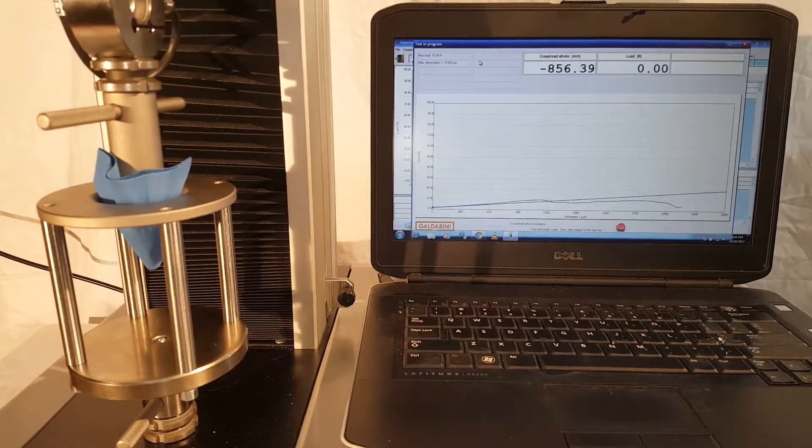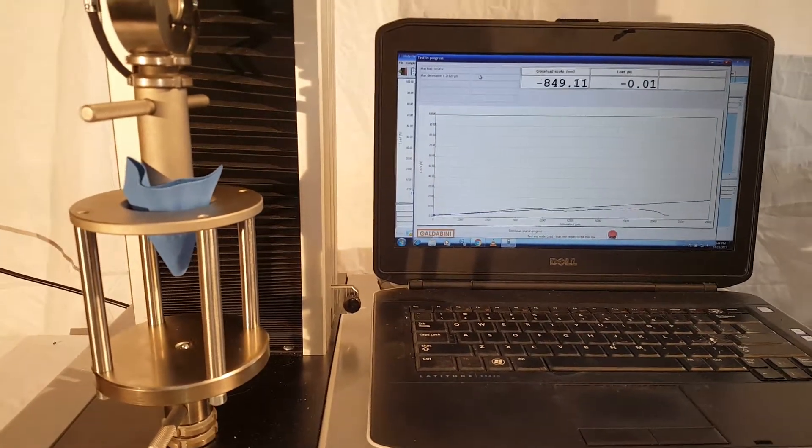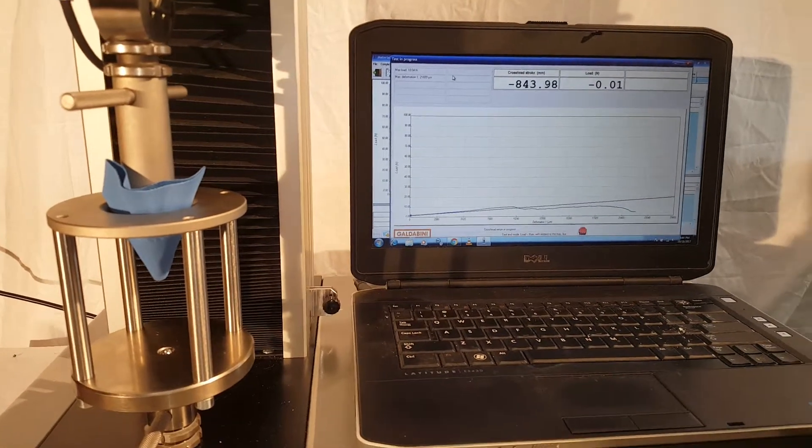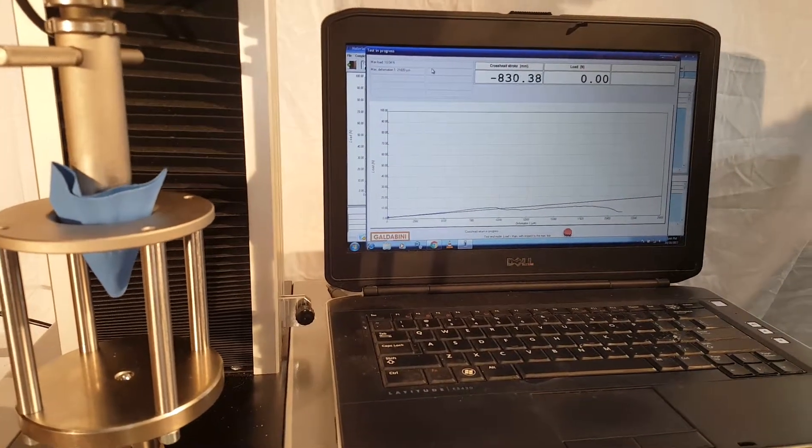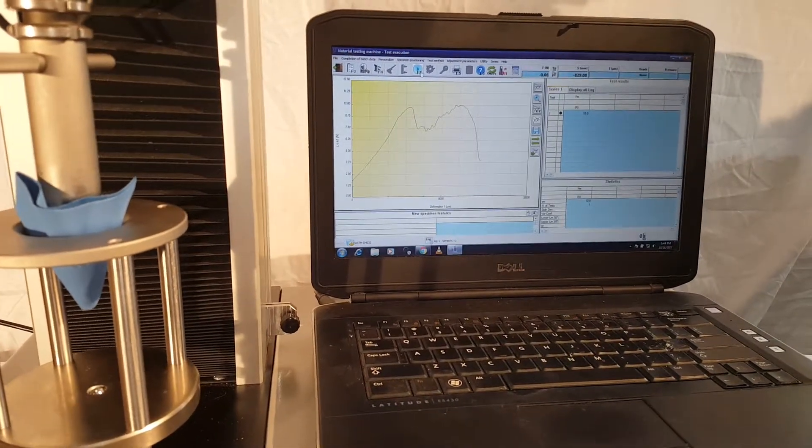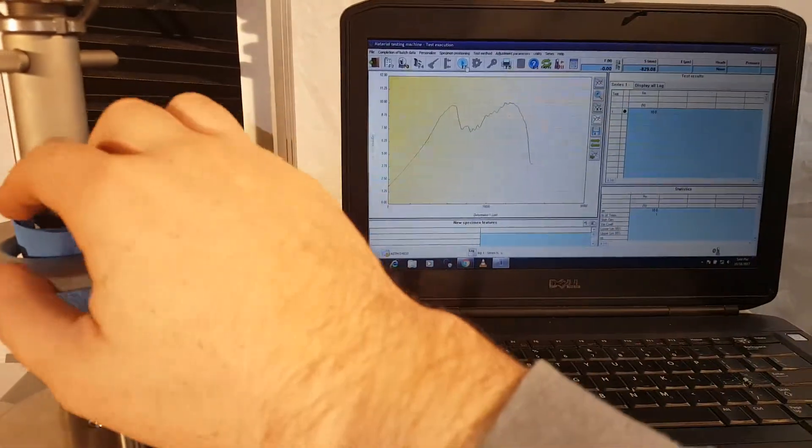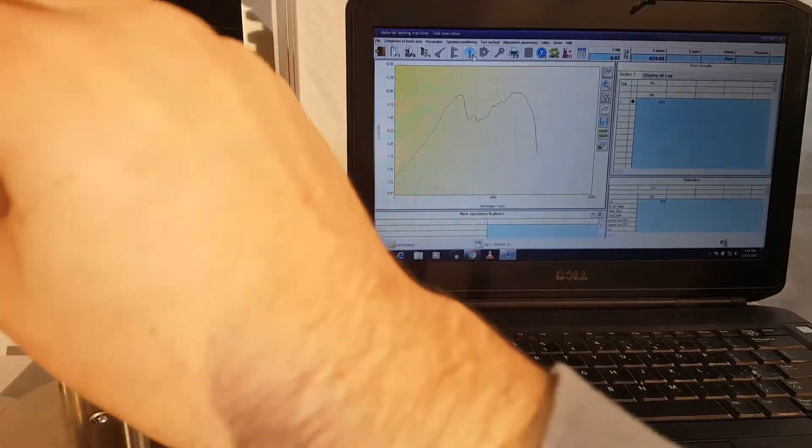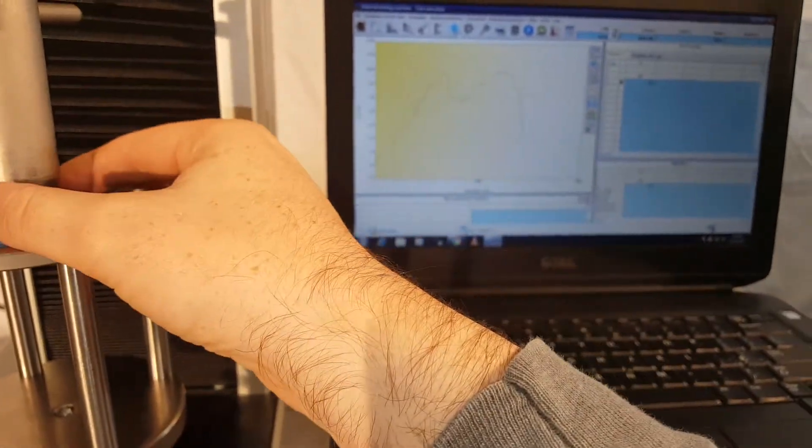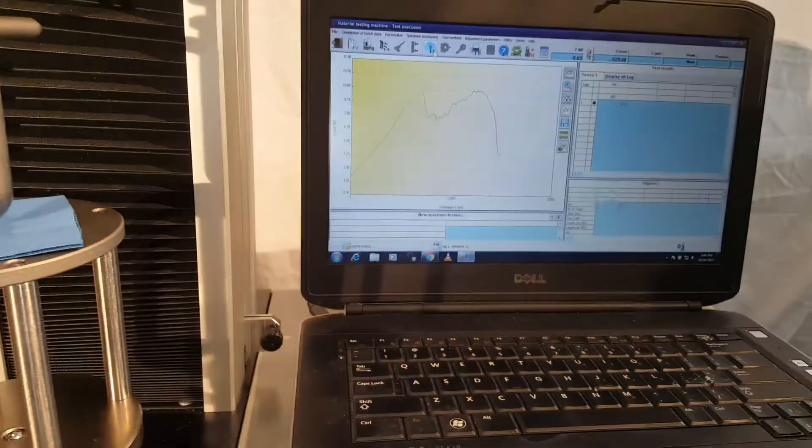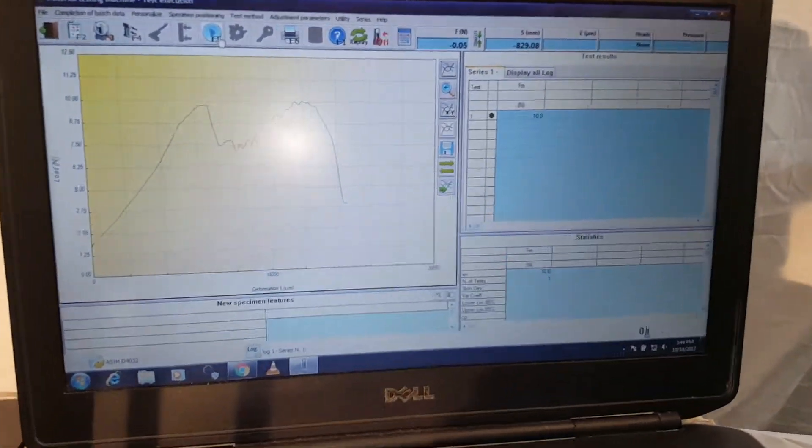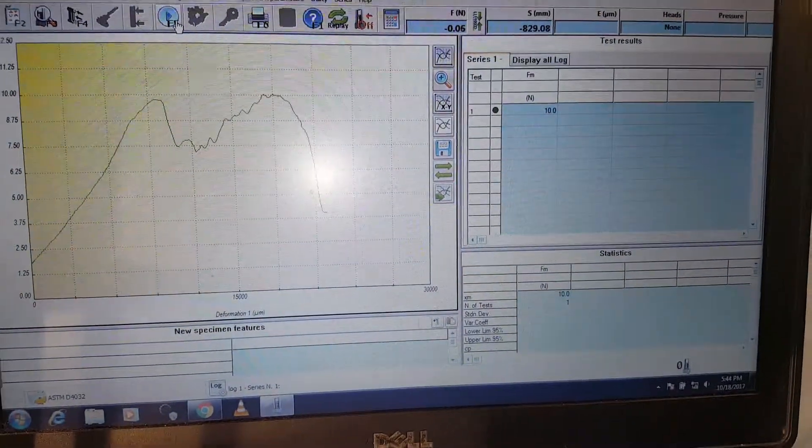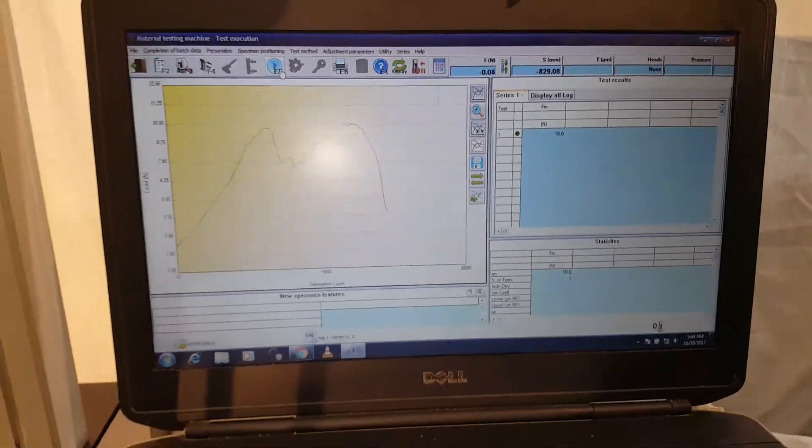All right. And once the test completes, it will return to home for us automatically and it will log all that data. You can see the force curve there, a little uneven, but no worries. We can still measure the maximum load. You can see here about 10 newtons or so.